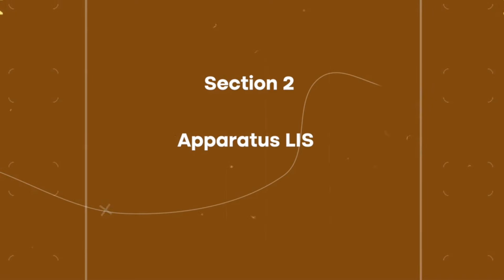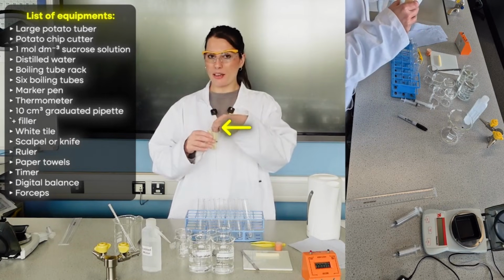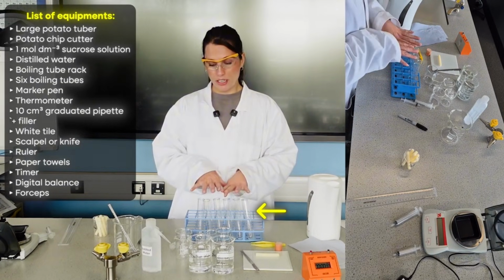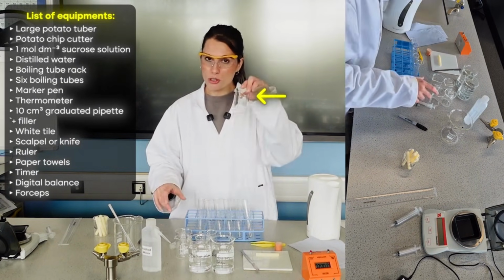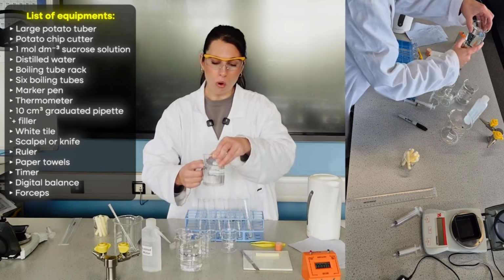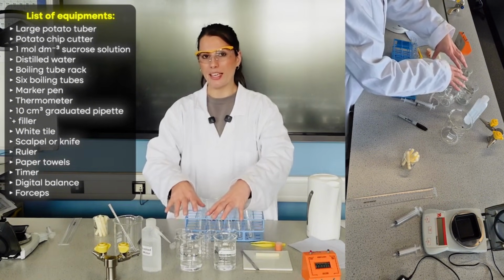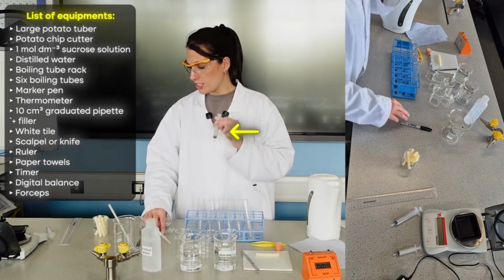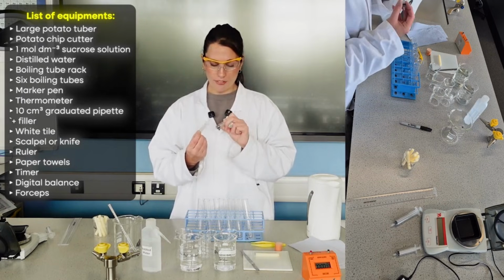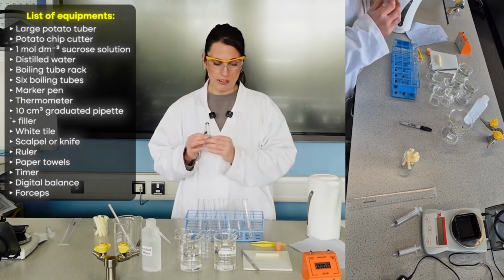So the equipment that I've got then, I have got pre-cut for me 6 potato cylinders. I've got 6 boiling tubes. I've got a range of smaller beakers and also my distilled water and 1 mole of sucrose solution to start with. Those I'm going to be using to create the dilution series, as well as these different size syringes. I've got a 10 milliliter and a 5 milliliter syringe. I'll be using those in my serial dilution.